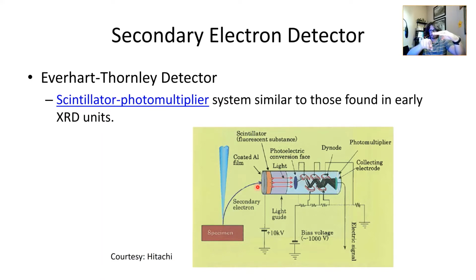So if I have a lower surface, the energy by the time it hits this detector is going to be less than if it was right close to that detector. That's how you get depth of field type imaging. Anyway, you eject this electron, it hits this array of dynodes, which causes the cascading electron effect. So I'm amplifying the signal, getting an electronic signal, and you blow up that signal relative to your scan area, to your screen, and that's how you have magnification in a SEM.